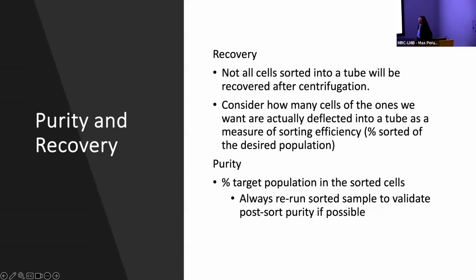In terms of recovery, we always recommend that you spin down your cells post-sort and then decant and then resuspend to be able to get the maximum recovery afterwards. It also depends a little bit on how many cells you're sorting. Of course, if it's only a few hundred or something like this, then it's probably not what you're going to do. But keep in mind, if you're sorting thousands or tens of thousands of cells, always spin your tubes down before you do any downstream experimentation.